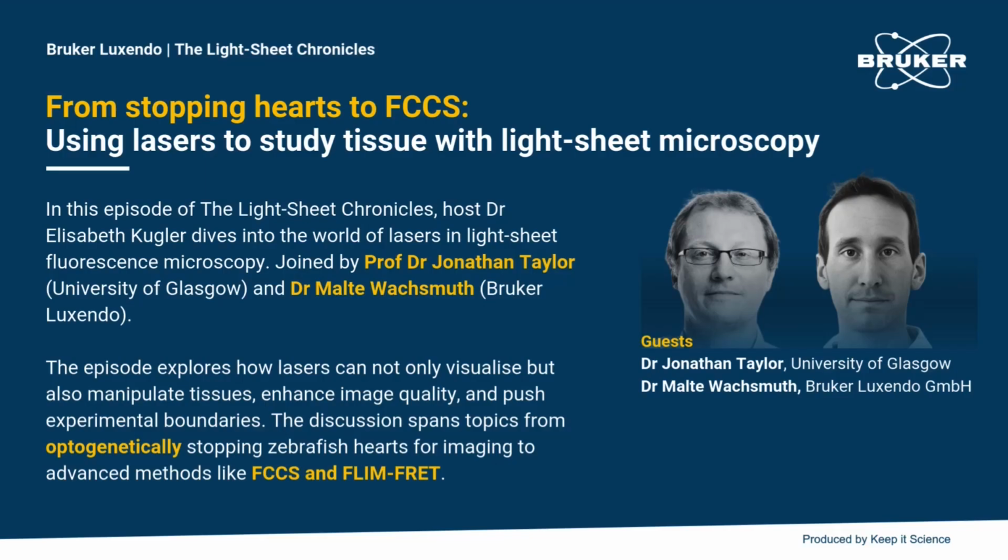And then the FRET process means that the fluorescence lifetime of one of these fluorophores will be modified depending on how close the other one is to it. So you've basically got a readout of fluorescence lifetime where the lifetime changes depending on how much this elastic linker is stretched, which in turn is telling you how much tension that particular molecule is under. And then Anna Lagendijk engineered this into zebrafish cadherin. So there was a live zebrafish model that embedded this into the endothelial cells of the fish, and so you're getting this molecular tension readout in a live animal.